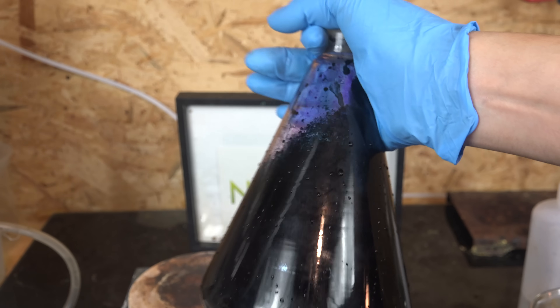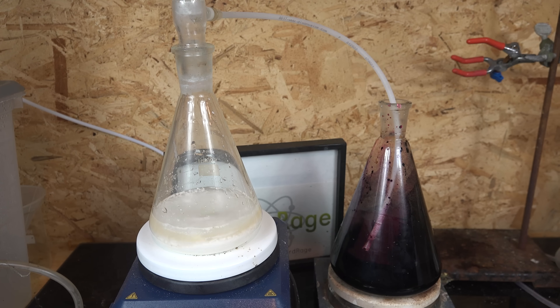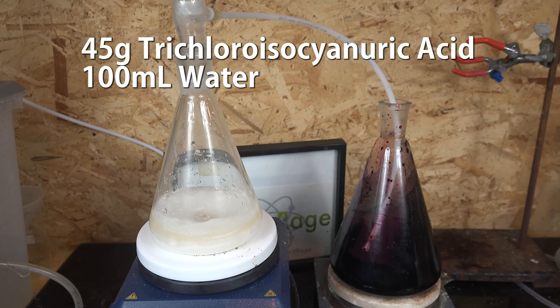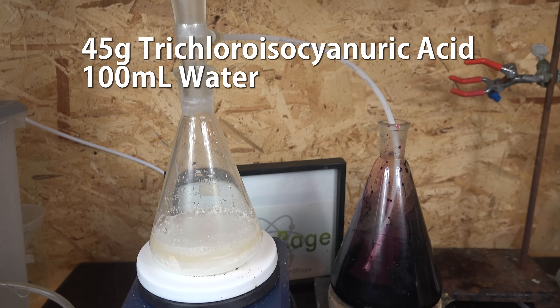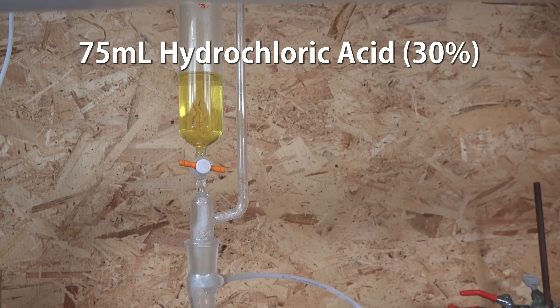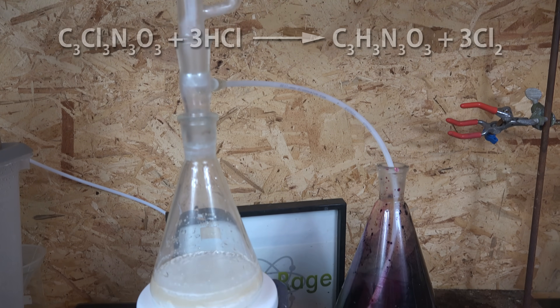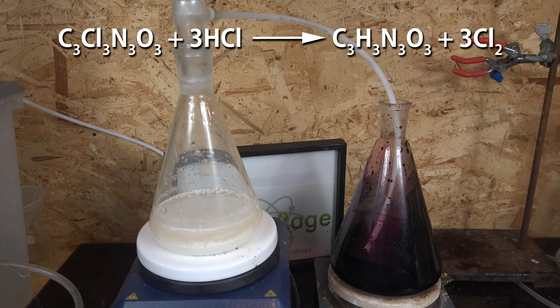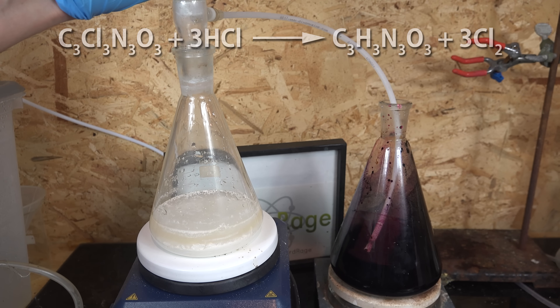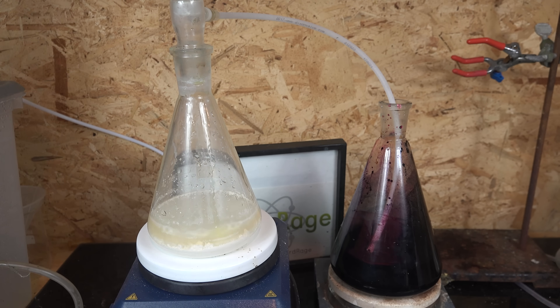The fastest and highest-yielding method is to use chlorine gas. I have here a chlorine generator consisting of 45g of trichloroisocyanuric acid in about 100mL of water, and 75mL of hydrochloric acid up top. The acid is dripped into the trichloroisocyanuric acid and generates chlorine gas, which is fed into the flask of potassium manganate. We don't need to stick the gas tube directly into the solution and risk backflow.